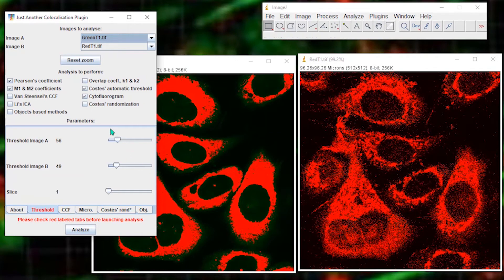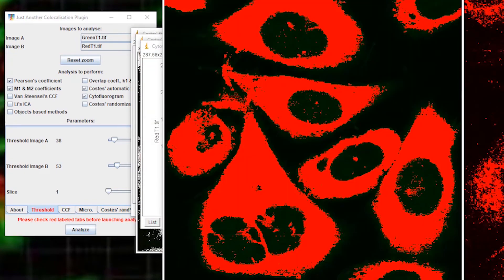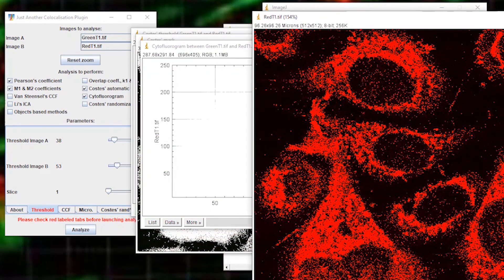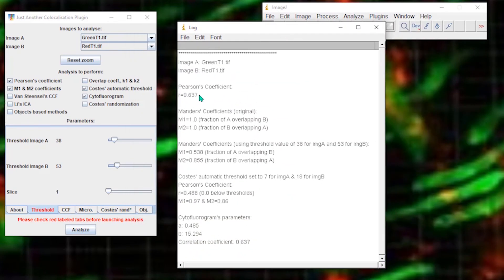I'm collecting the Pearson's coefficient and the Mander's coefficients. The thresholds are set automatically by the algorithm, but you can adjust these to suit your own purposes. If we choose analyze, we get a whole bunch of results. The value we're interested in is the Pearson's coefficient of 0.637, and under the threshold, 0.488. You can choose to use whichever you like. That's the process for collecting the coefficient values we will use in the next segment.